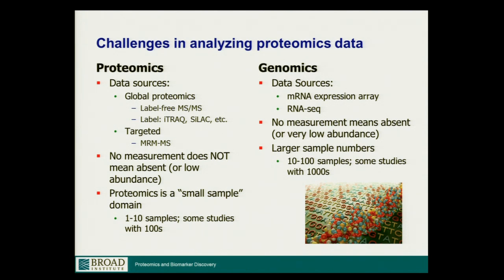The data sources are what I mentioned, the two classes. I wanted to emphasize that there is really a big difference in how you analyze it. The main differences that I see from a proteomics challenge perspective: in proteomics, when you don't measure a peptide or a protein, it does not mean it's absent.